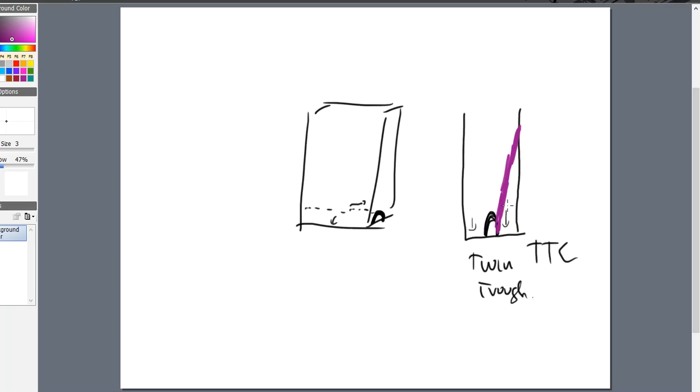That's the way that I lean it. I can do it on the front side too, I just have to put the plate in a little backward, but I can do it on both sides, and I can develop two plates at the same time if I have the appropriate chamber. So I can put one in the back and one in the front. It's not a big deal. Develop both of them at the same time, put the lid on them, and call it a day.